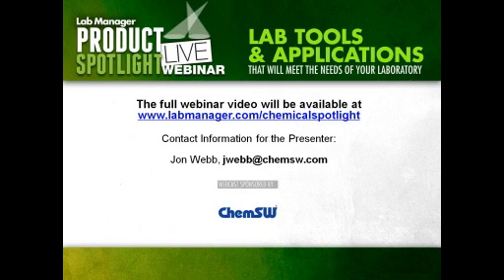Sure. Well, let me address that in a couple of different ways. My best practice is always that less is more. If you only have to report on the specific quantities of materials that you have on site from the time that it's arrived to the time that it's disposed, we call that tracking by the actual bottle, so container-based tracking. So if it's a 4-liter container, when it arrives on site, we're just tracking that container as a 4-liter container until it's disposed, because it's always best to over-report than under-report.